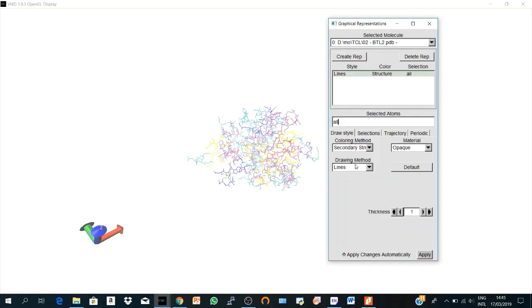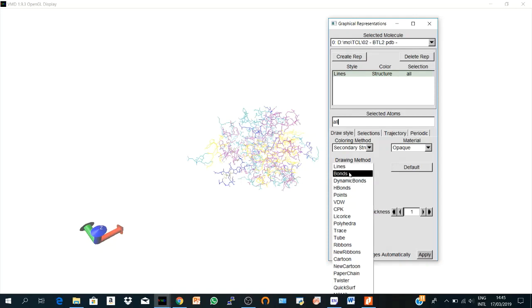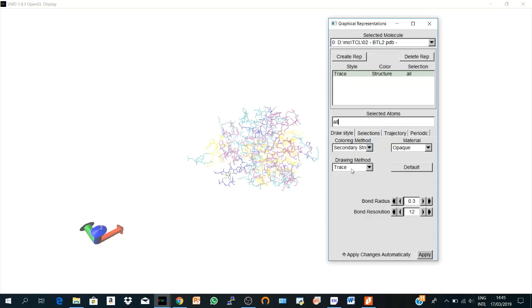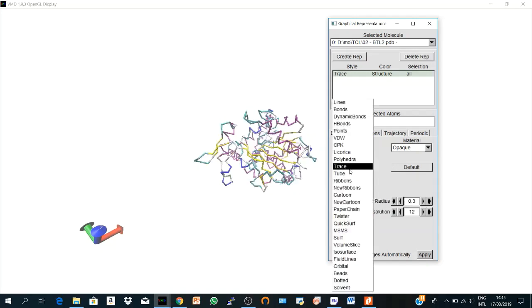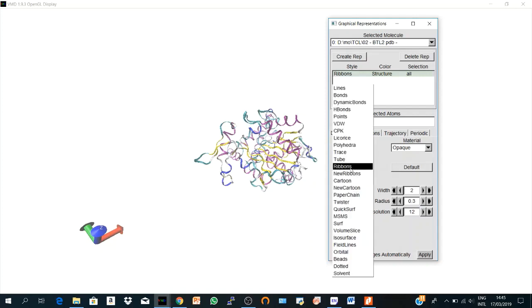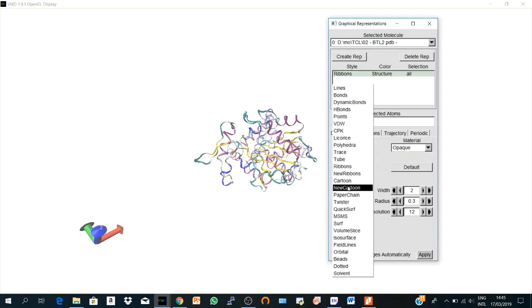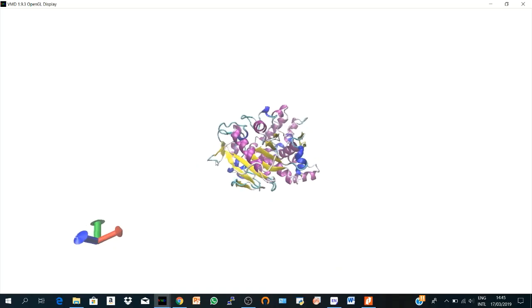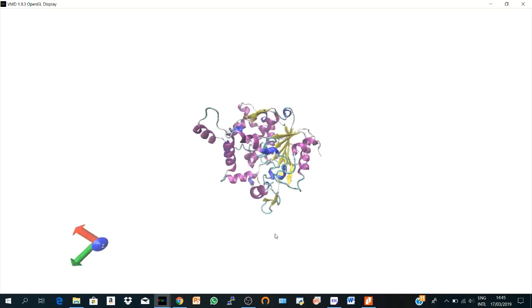And here we have the drawing methods. It's Lines here by default. You can choose according to Van der Waals, VDW, hydrogen bonds, dynamic bonds, CPK, etc. So many options. We have Trace here, we have Licorice. But the most popular one is the New Cartoon, as you know. It looks very nice.